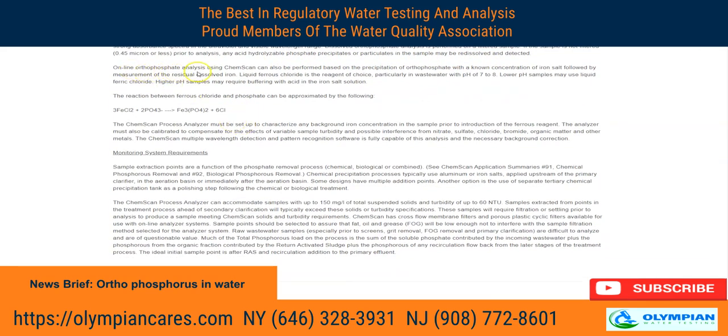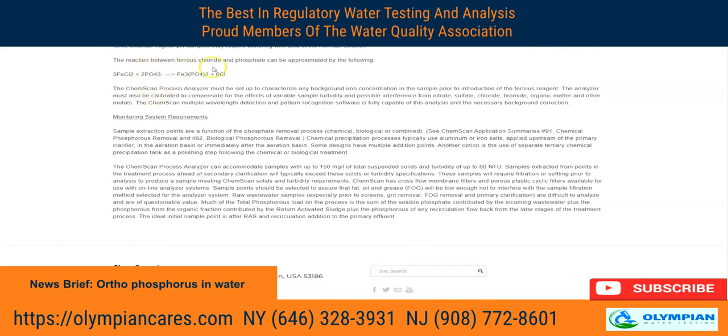Online orthophosphate analysis using ChemScan can also be performed based on the precipitation of orthophosphate with a known concentration of iron salt, followed by measurement of residual dissolved iron. Liquid ferrous chloride is a reagent of choice, particularly in wastewater with a pH of 7 to 8, and lower pH samples may use liquid ferric chloride. Higher pH samples may require buffering acid in the iron salt solution, and the reaction between ferrous chloride and phosphate can be approximated with the following equation.